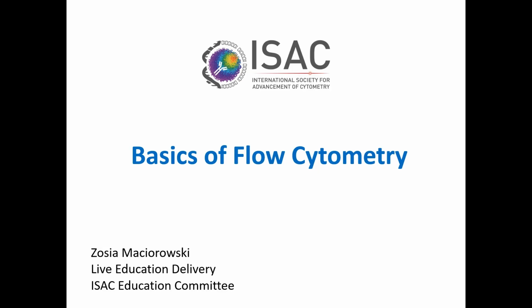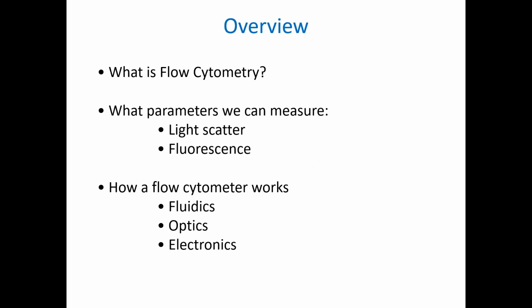I'm with the Live Education Delivery Subcommittee of the ISAC Education Committee, and today I'm going to talk about the basics of flow cytometry. In this talk, we'll discuss what flow cytometry is, what parameters we can measure, light scatter and fluorescence, and then we'll walk through the inside of a flow cytometer and see how it works.